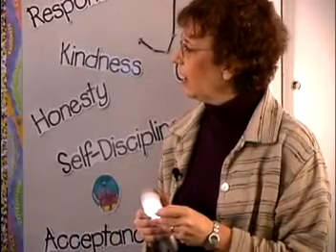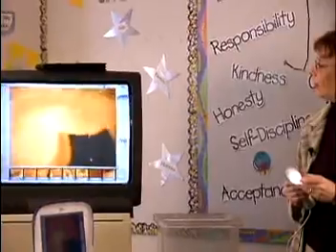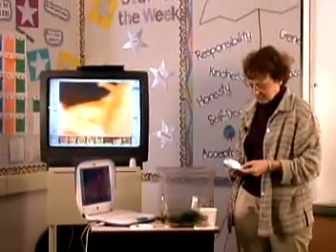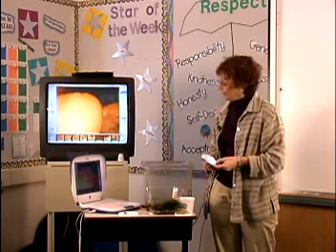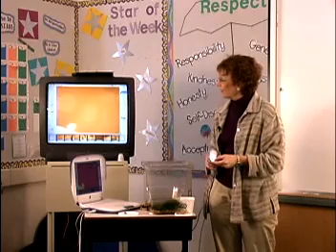We were concentrating on how their eyes are different and how the stalks are different and how that might affect their range of vision. And here we have another animal whose eyes are also on stalks. These stalks are very flexible. Can you see that little black dot at the end of the stalk? That's his eye. And you can see he's just moving it all over the place.